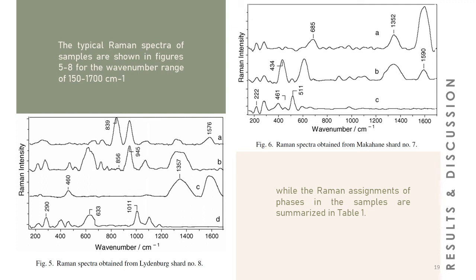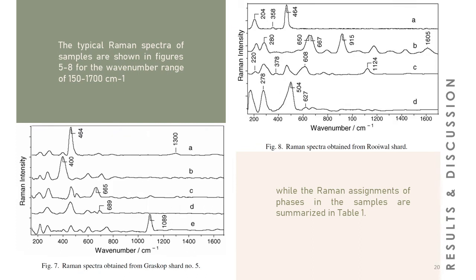In Figures 5 and 6, the bands at around 220, 280, and 405 cm to the -1 are said to be due to red iron oxide, and the presence of this reddish area throughout the sample and in the bulk of the body could be an indication that this pigment was one of the starting materials. Meanwhile, the XRF results revealed a relatively high content of hematite, which is greater than or equal to 7 mass percentage in Figures 7 and 8.